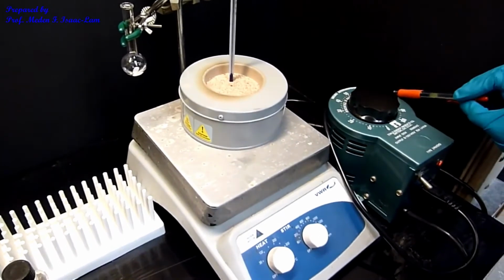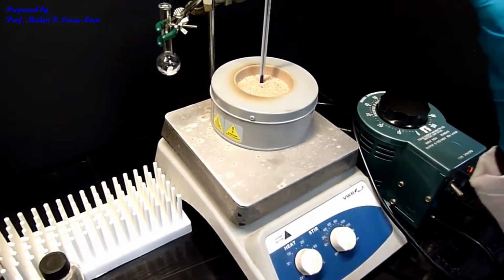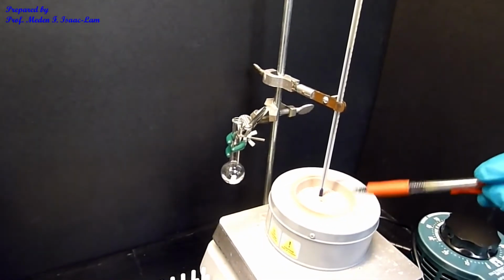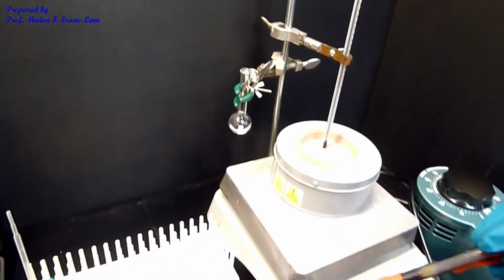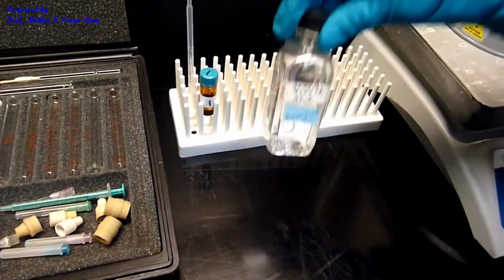And I set it to 70. The transformer is plugged directly into the outlet. So the temperature right now is around 145. So I think we're ready to put the components in here. And then I have the acetic acid. This is the glacial acetic acid.